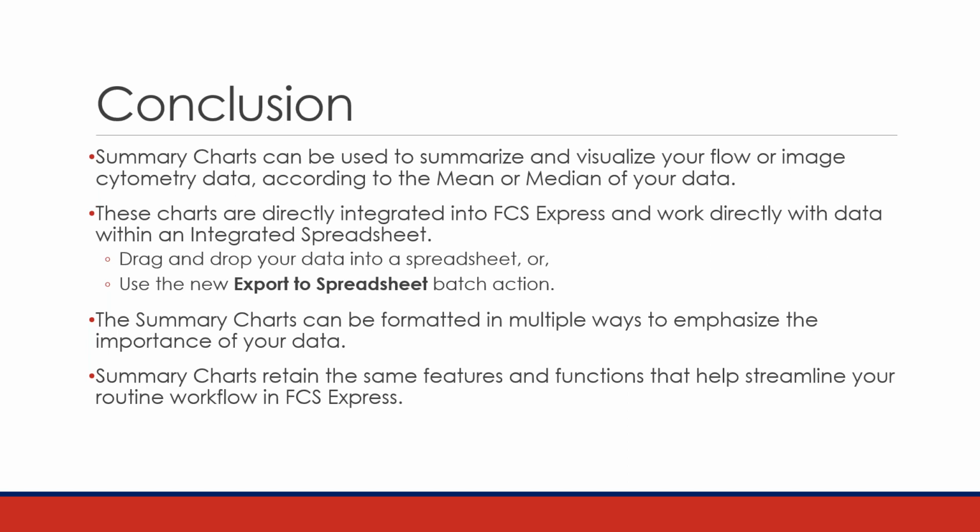And then viewing all the different charts that we've seen today, you can see that we can format these charts in multiple ways to basically emphasize the point that you're trying to make from the data that's in these charts. And the beauty is that by integrating this directly in FCS Express, you should be able to retain the same features and functions that help streamline your routine workflow in FCS Express.